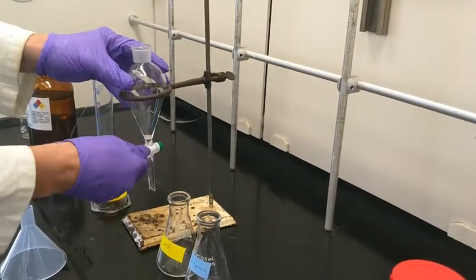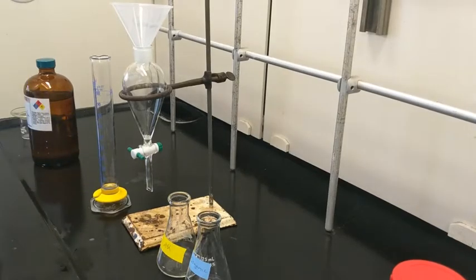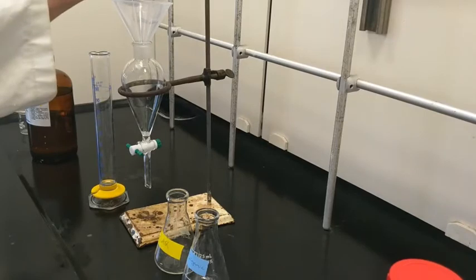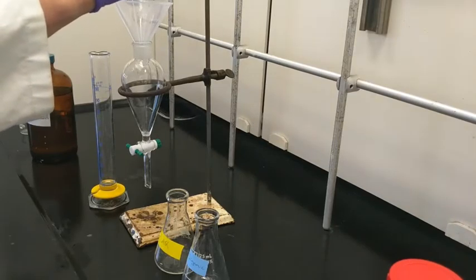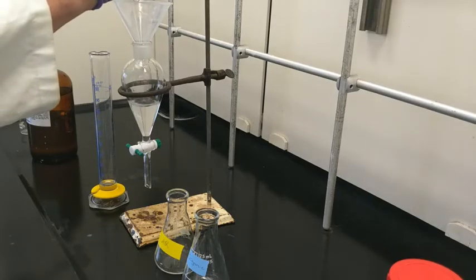Take care that the valve is closed. Notice that the handle runs perpendicular — that indicates the direction of the bore, so the valve is closed. I'm going to add the solution using a funnel so I don't contaminate the seal and weaken it, because we're going to turn the funnel upside down and agitate it, and if the seal is weak and pressure builds up it's going to spill and make a mess everywhere.